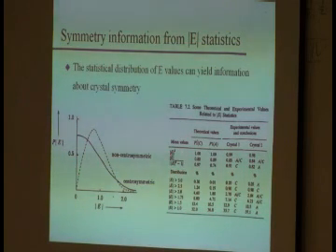Here's an example, okay? Your E squared mean values should be 1. Never mind whether your structure is centrosymmetric or not, because these are normalized structure factors, right? So if you sum them all up, they'd better be on average 1, because we normalized by the scattering contributions of all the atoms. So not very good for distinguishing centrosymmetric and non-centrosymmetric structures.